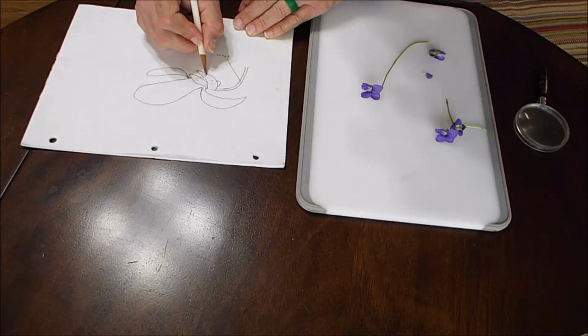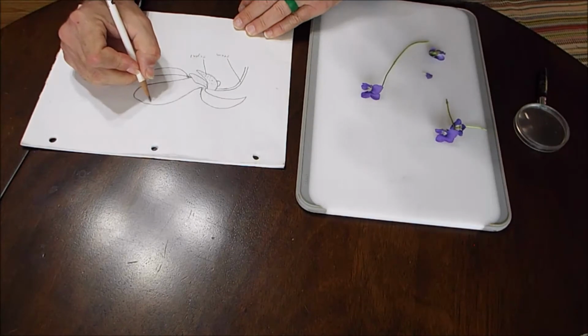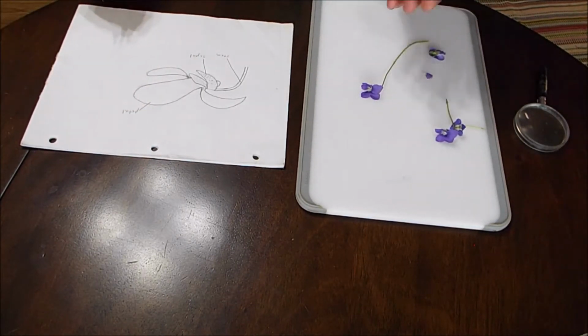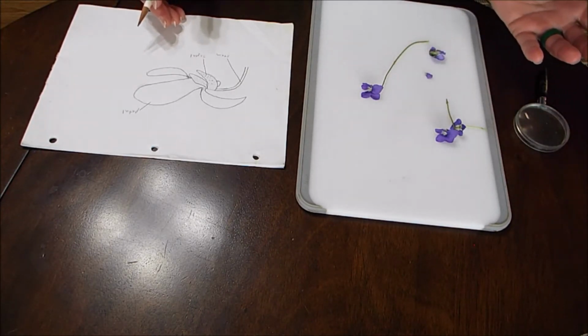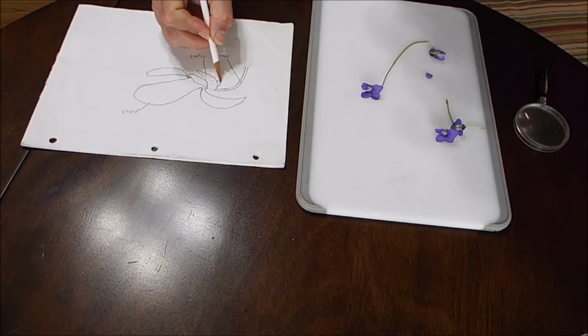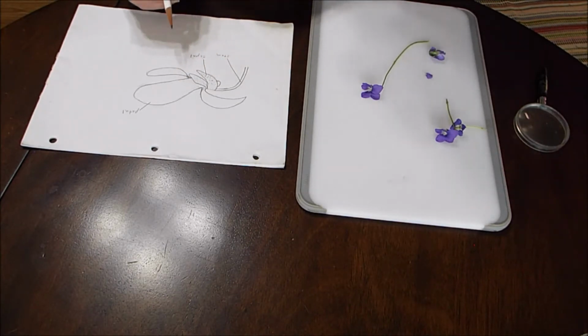And this is going to be sepal. And this is going to be petal. And there's really nothing else that we can identify from this image with great certainty. This little butt sticking out here could be part of the ovary, but I'm just not going to go there.